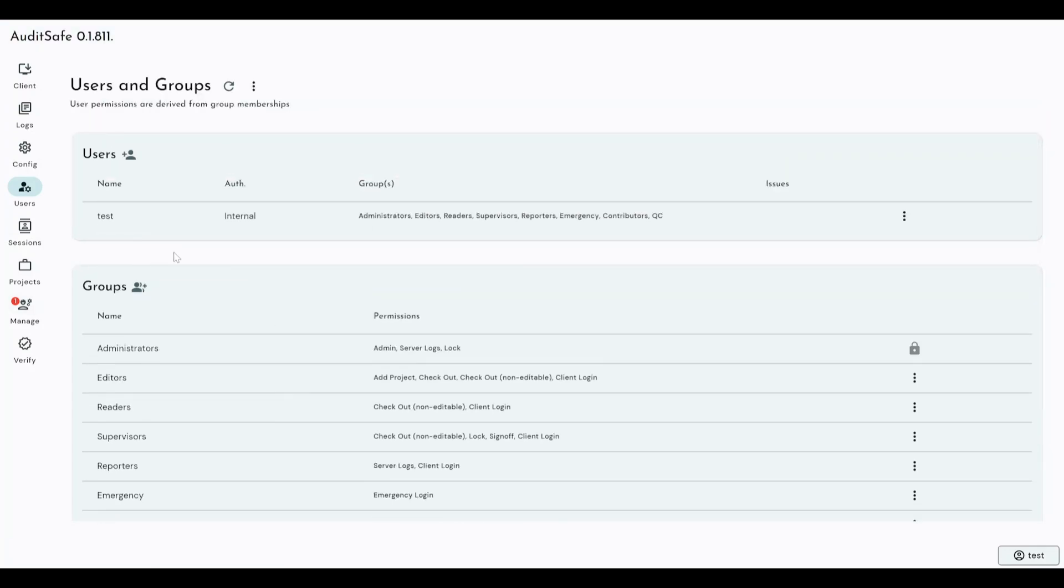And it's a much quicker way, if you've used our older TotalLab GXP module software, this has been a very much sought after feature. The ability to create users and to be able to throw them into groups, rather than having to set up each user individually with their own permissions every time. It becomes especially burdensome if you've got a very large site that you're trying to administer, and lots of different users using the software.